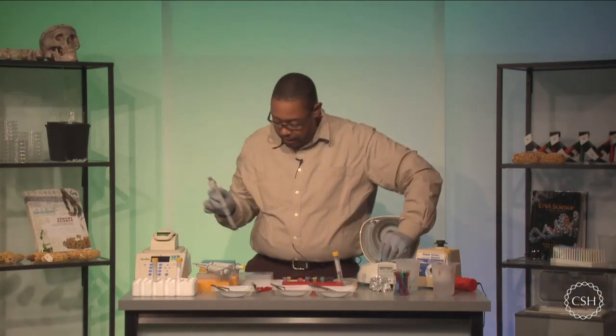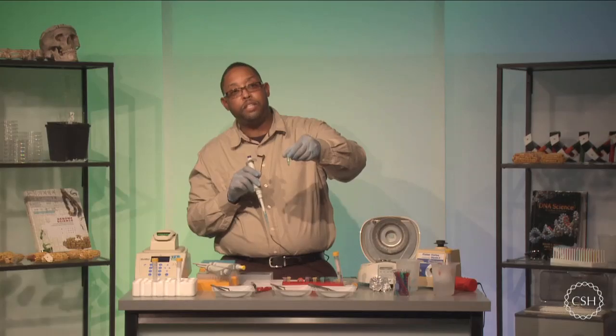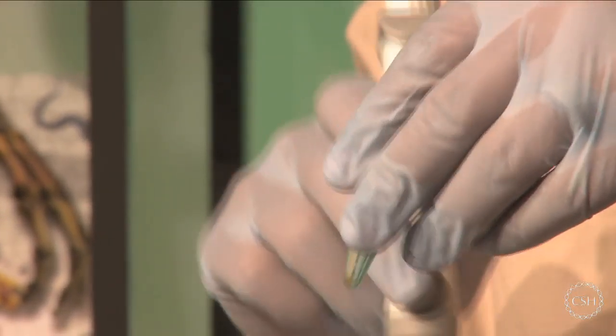Now, lastly, I'm going to go to my insect. As you can see, all the debris is at the bottom of the test tube, and I'm going to collect the clear lysate at the top.